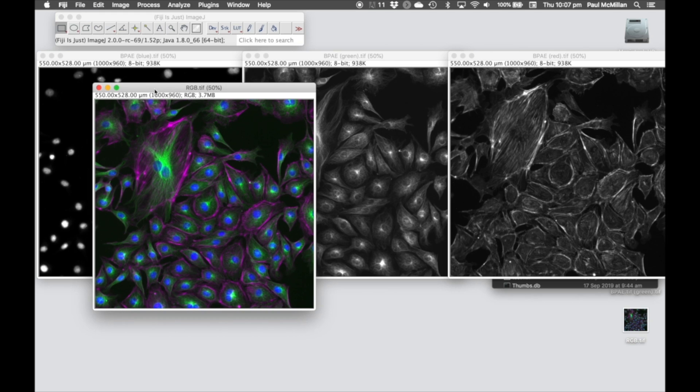That's how to take three individual channels and merge them into the same single image. Now the channels need to be the same physical size for that merge to happen.